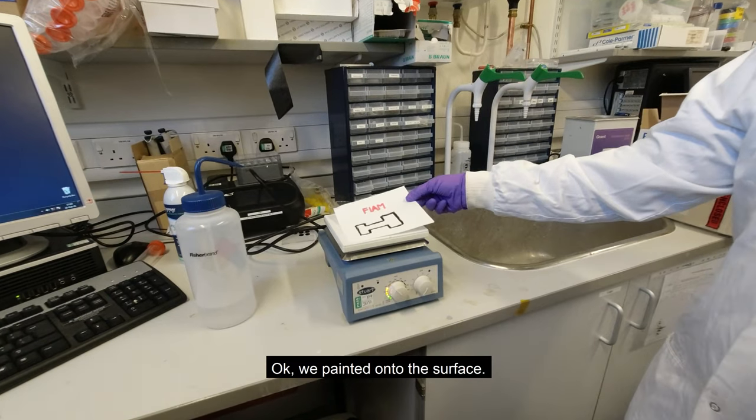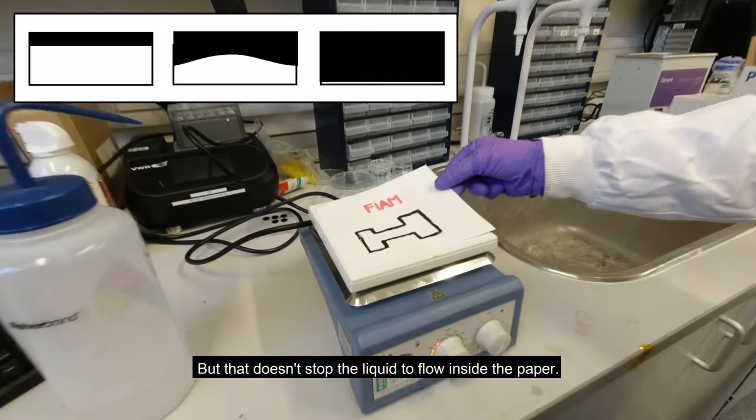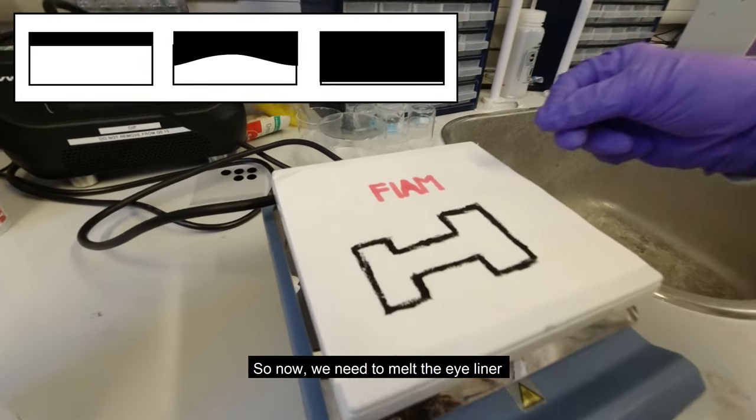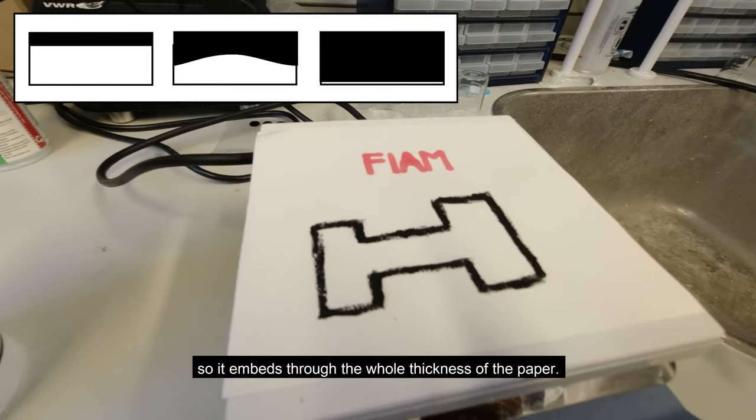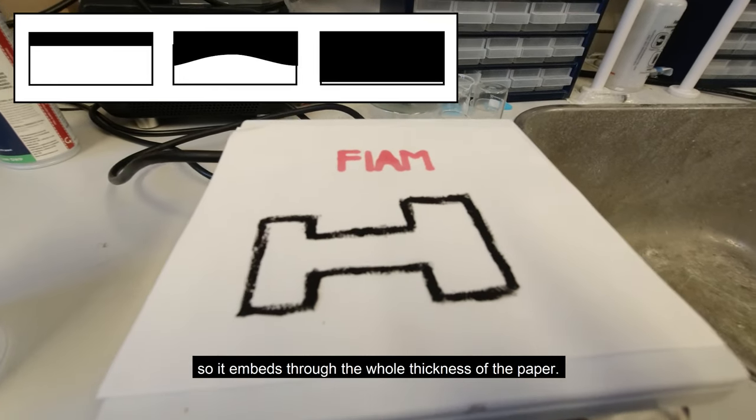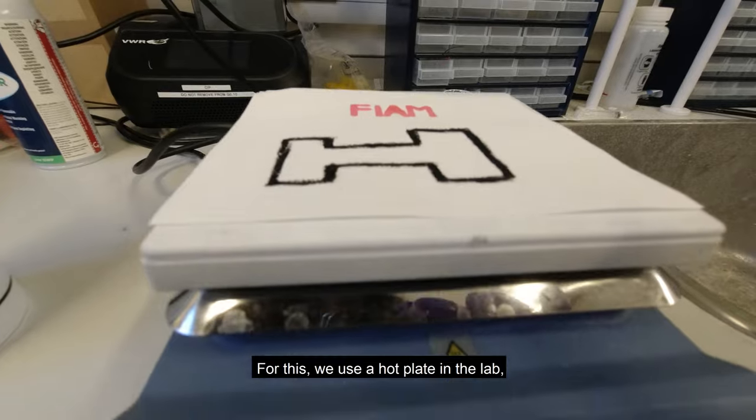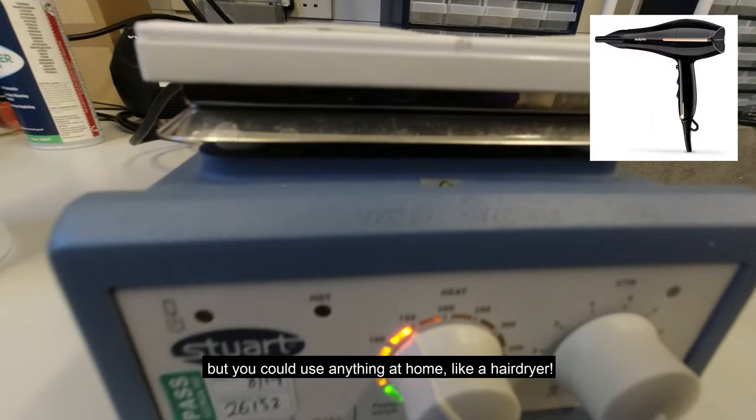Ok, we paint it onto the surface, but that doesn't stop the liquid to flow inside the paper. So now, we need to melt the eyeliner so it embeds through the whole thickness of the paper. For this, we use a hot plate in the lab, but you could use anything at home, like a hairdryer.